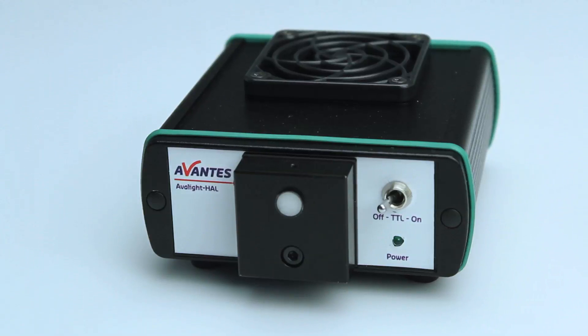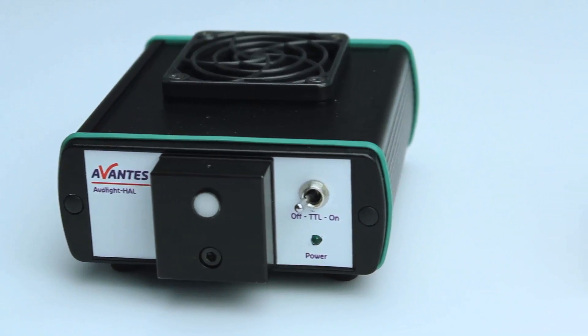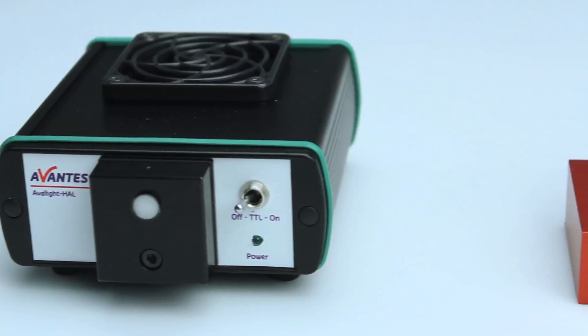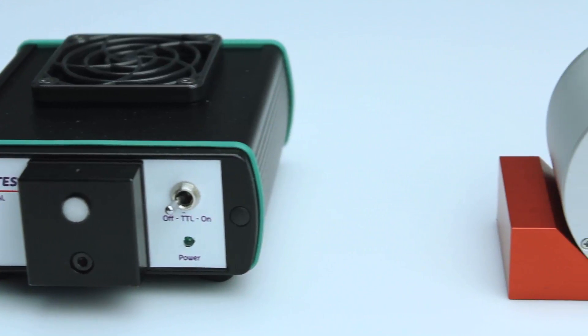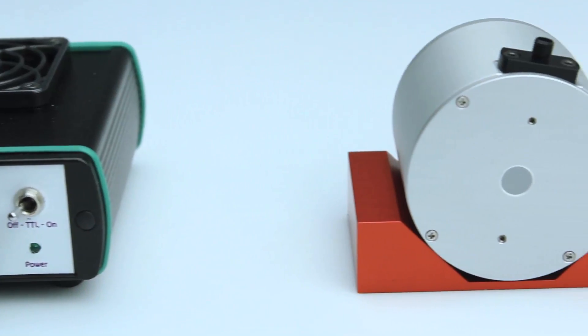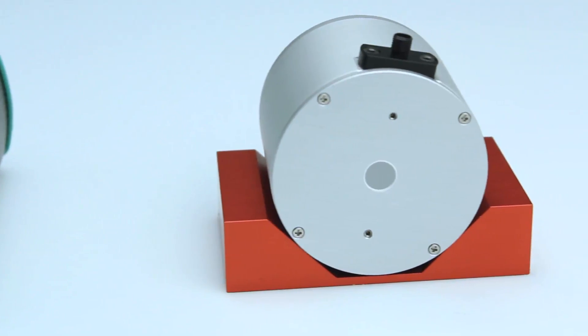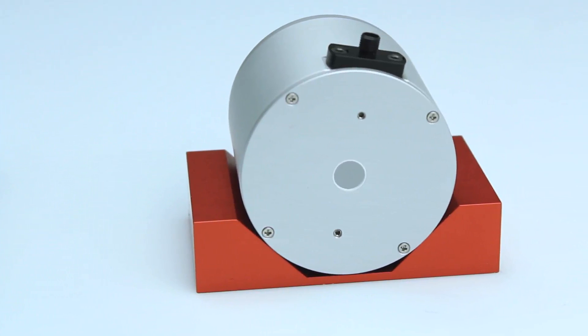If you want to measure irradiance, you need to have a calibrated system. To do this, you need an Avantis light source with a calibration file. You can calibrate your system with an integrating sphere or a cosine corrector.